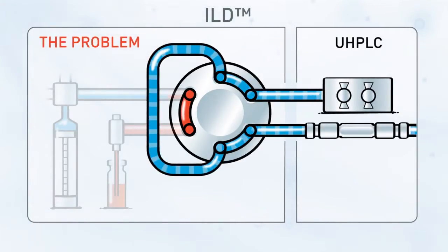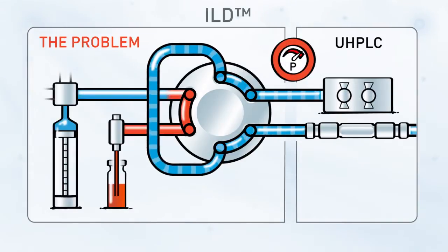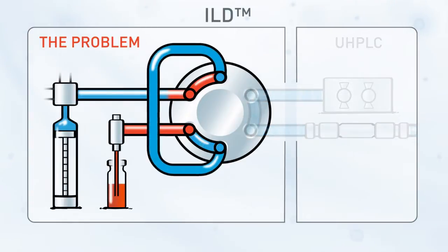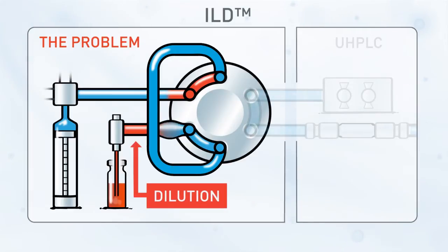During the separation, the sample loop is under ultra-high pressure. The syringe has filled the needle plus connecting tubing with sample to prepare for injection. When the injection valve switches into load position, the compressed liquid in the loop expands forcefully via the only outlet, the sample needle. The effect is uncontrolled dilution of the sample near the inlet of the sample loop.